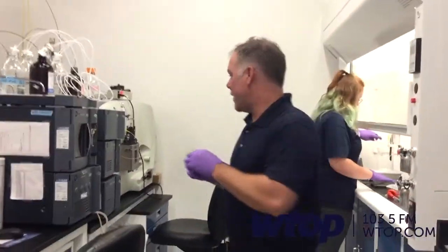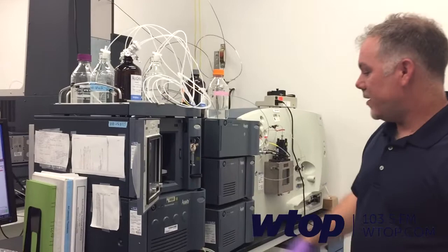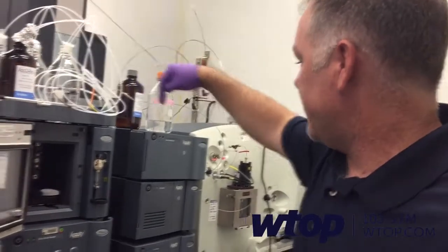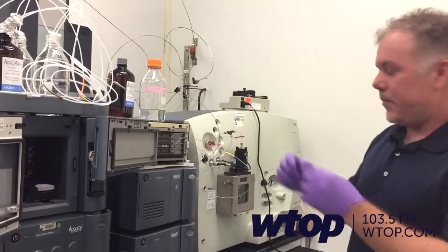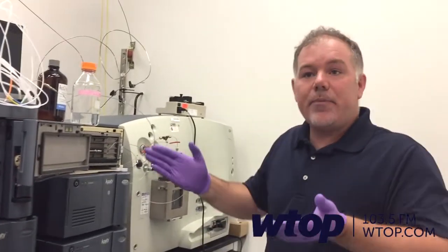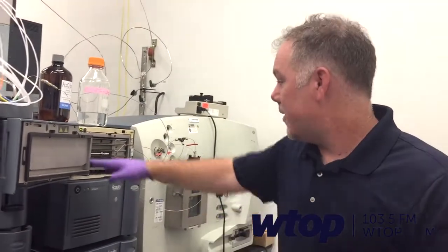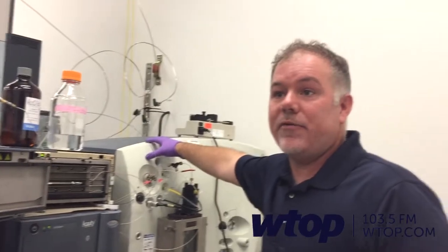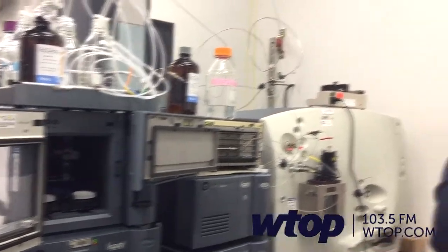We take our extract and put it inside the sample analysis tray — this is a liquid chromatography tool. The way it works is fluid gets injected into columns kept at a fixed temperature. The organic compounds separate as a function of hydrophobicity — how soluble they are in water. They get pushed through these columns and then detected by mass using a mass spectrometer. This is a time-of-flight mass spectrometer, the same instrument we used to detect the amino acid glycine in the Stardust materials. It's a very sensitive technique; you don't need much material at all.